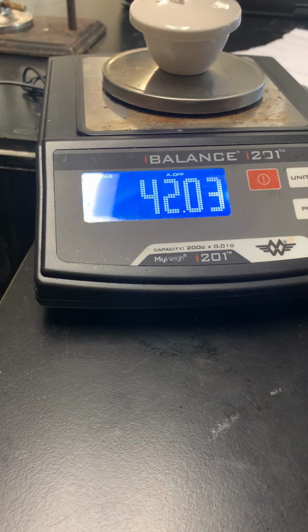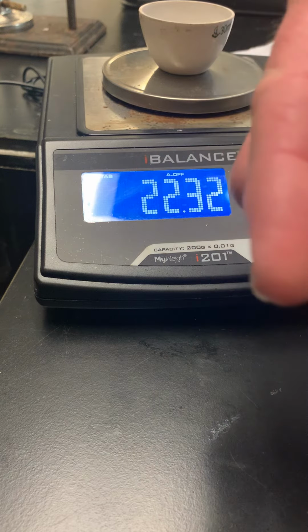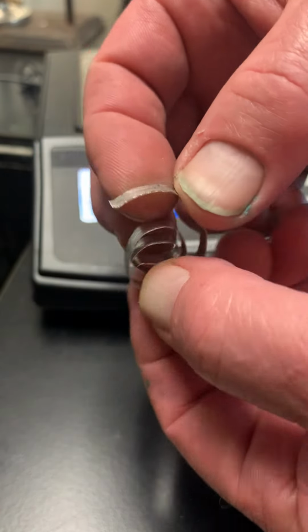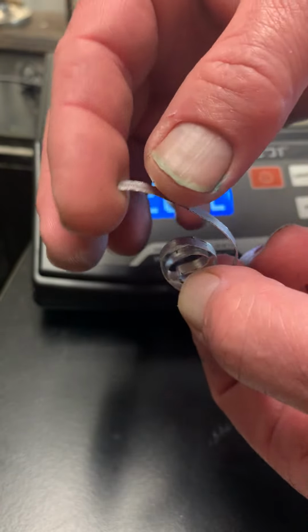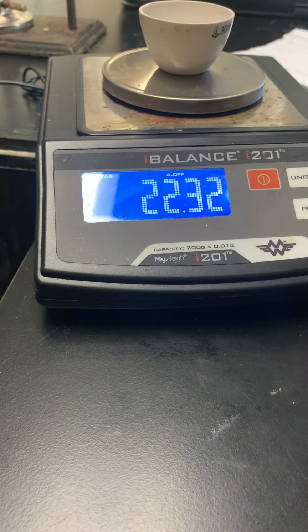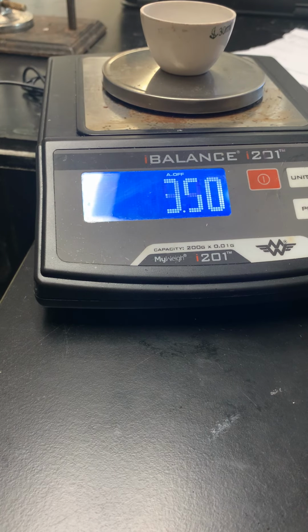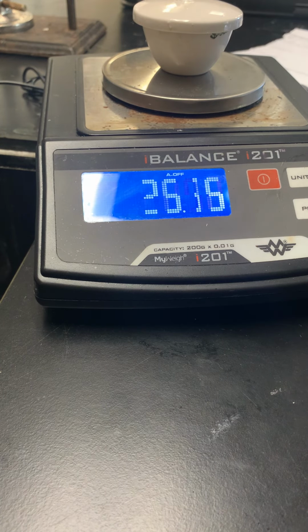There we go. And then we put the magnesium in it. This is what magnesium looks like. A nice silver metal. It's flexible, so we bent it around. Put it in there, so it's at the bottom, and put the lid back on. And now the mass has changed because we've added some magnesium. And by doing a subtraction problem, we can find out how much magnesium there is.